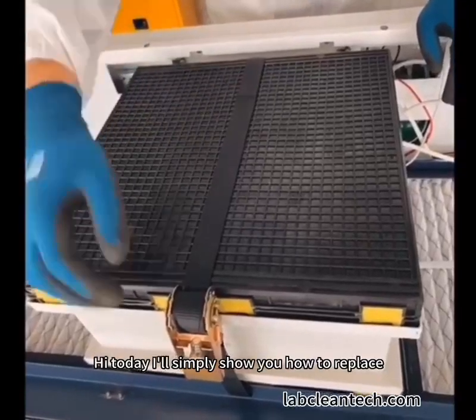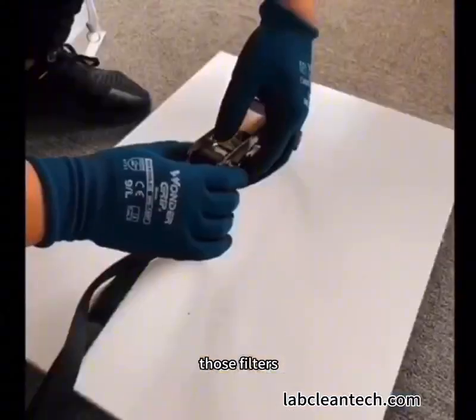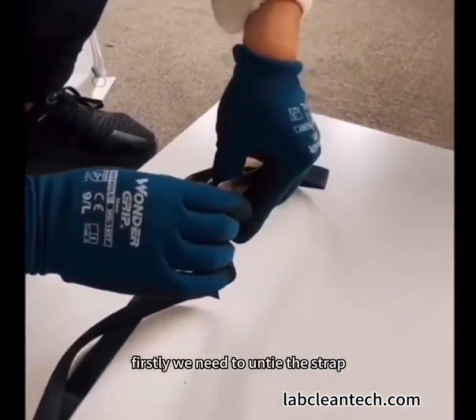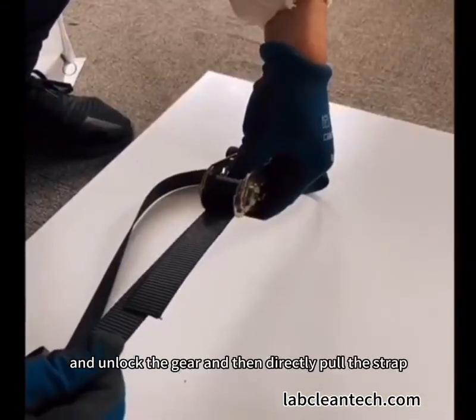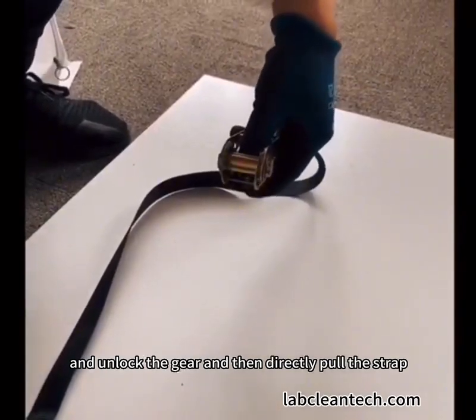Hi, today I will simply show you how to replace those filters. Firstly, we need to untie the strap, press the two buckles with your thumb, and unlock the gear and then directly pull the strap.